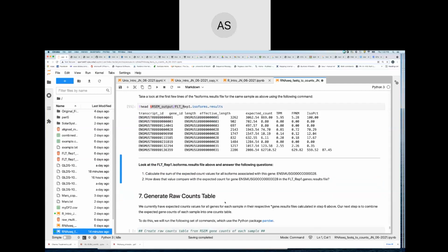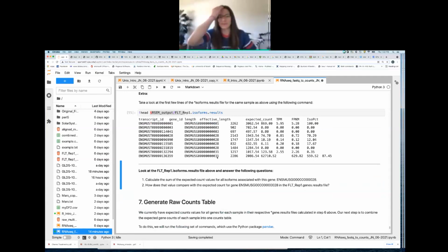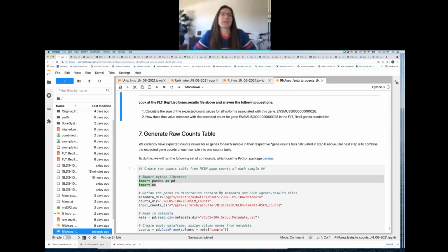So Lauren, when she starts, she'll show how to look at this in Pandas, so that way everything's more prettily aligned in the output. I think I made up a word. Okay. Any other questions for generating genes.results?